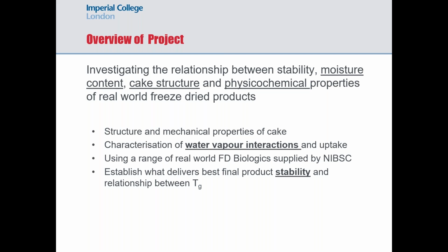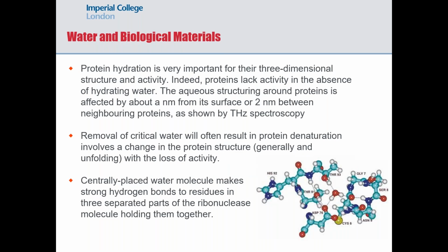We are particularly interested in understanding, in the formulation space, what's going to give us the best product stability, and particularly how stability relates to the glass transition temperature of the freeze-dried solid. That's an important part of the presentation.